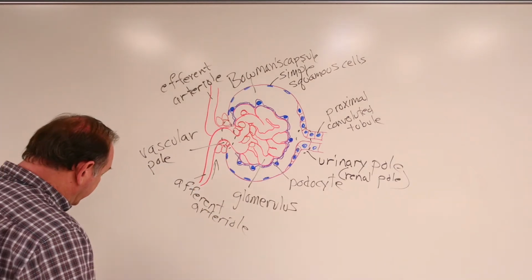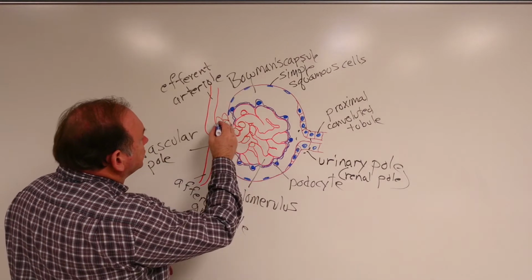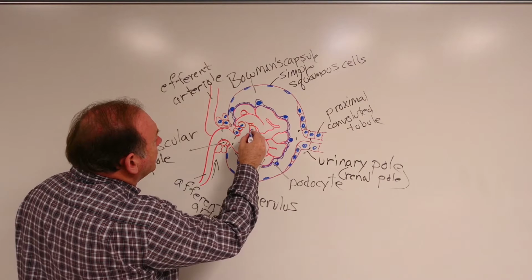So these special cells, mesangial cells, I'll color them in a little bit here in a minute, put some nuclei in them.